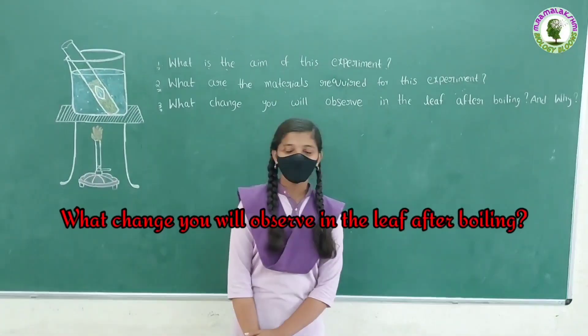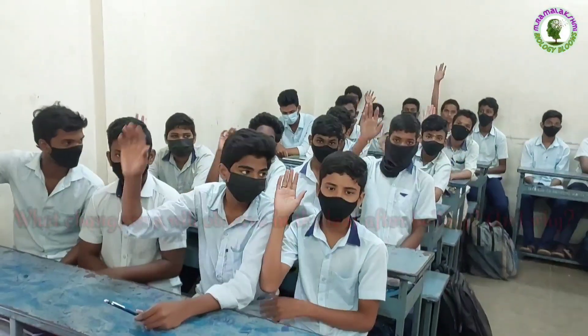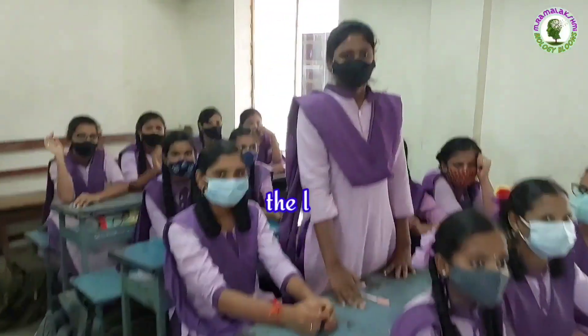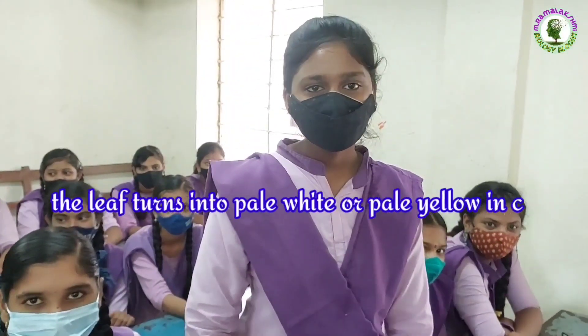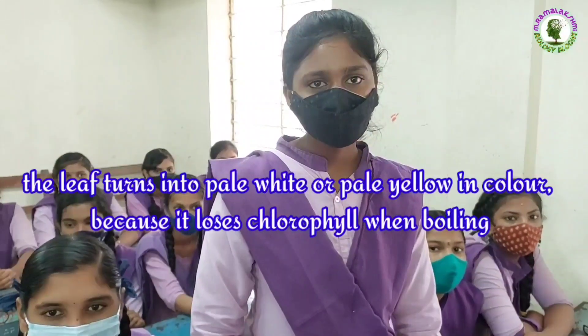What change will you observe in the leaf after boiling, and why? Samira: The leaf turns pale white or pale yellow in color because it loses chlorophyll when boiling.